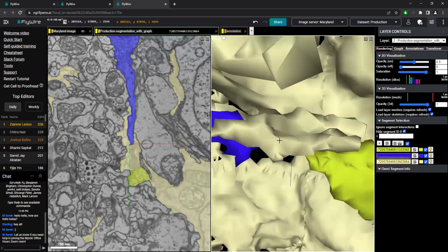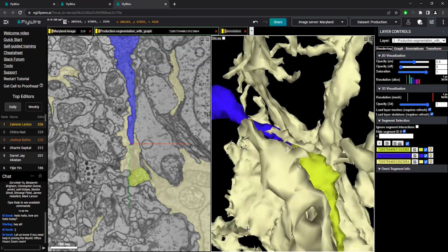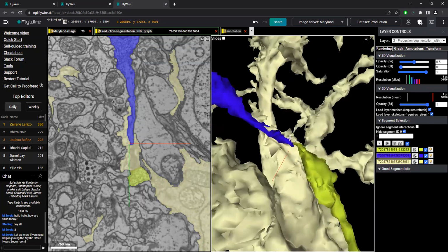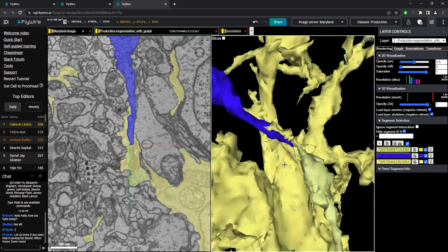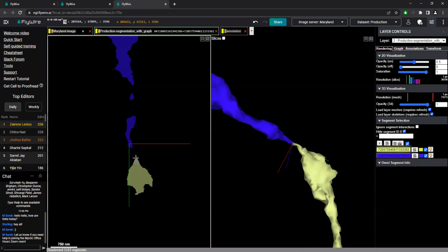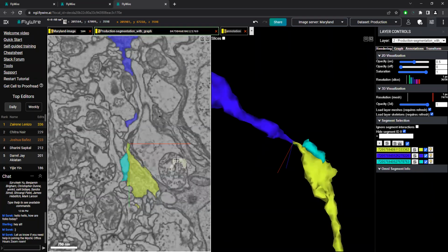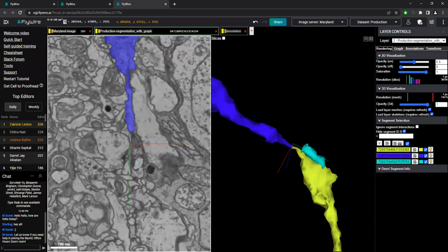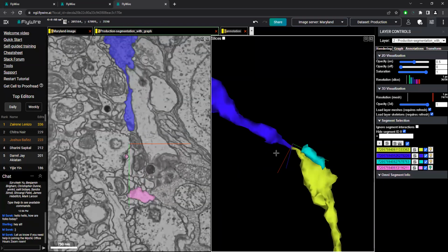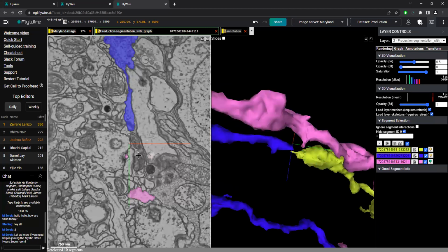And well, if we click this, that's a huge glial mess that fills that all in, and that certainly doesn't have any merge-like pieces that are merged onto the glial mess that look promising. And any other continuations? Well, let's see. No, that goes to this little tiny piece here. So that seems to be different.